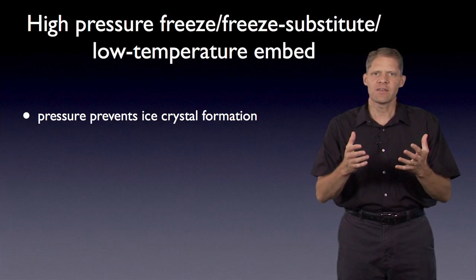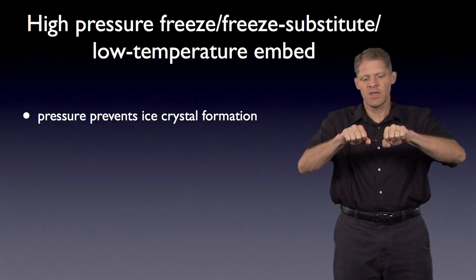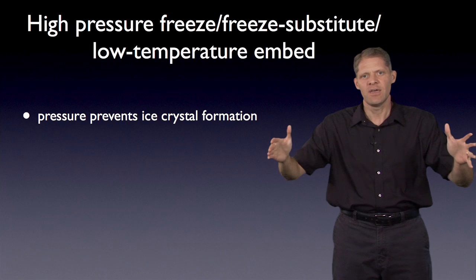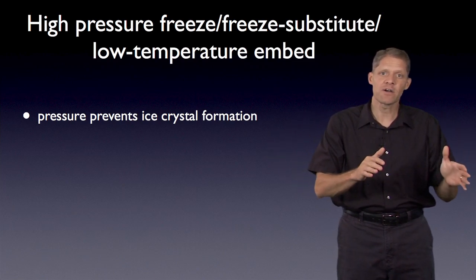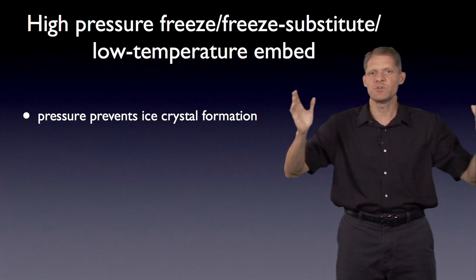Now we know that if you take liquid water and you slowly cool it, the water molecules will bounce around until they find hydrogen bonding partners to form an extended ice crystal. And the ice crystal is less dense than the liquid water, and so the water expands as it crystallizes. And this, of course, would destroy the cell.